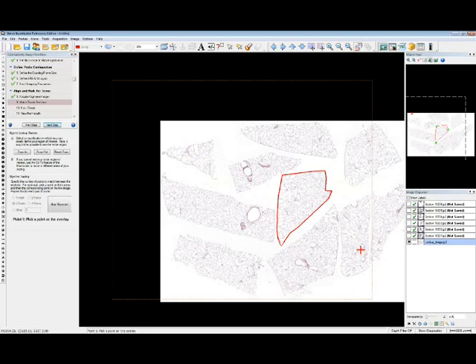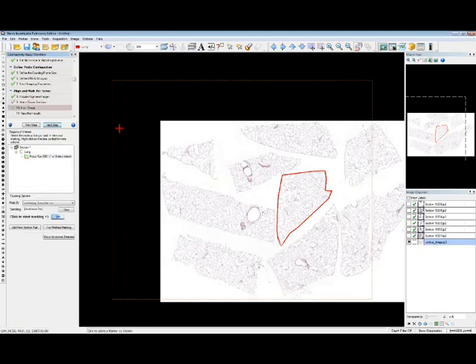And once it lines up, if I'm not happy with how it lined up, I can keep lining it up and tweaking it a little bit at a time until I get it just right. In this case, it looks pretty good, so I can stop here. I'm going to go ahead to the next step. And at the next step, we can actually proceed with counting. Right now, the software is loading all the images that we gathered.